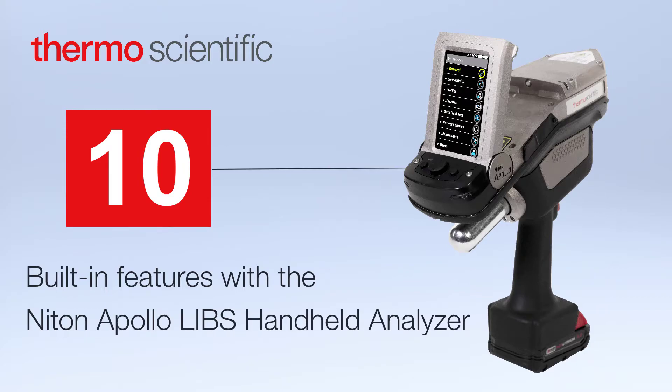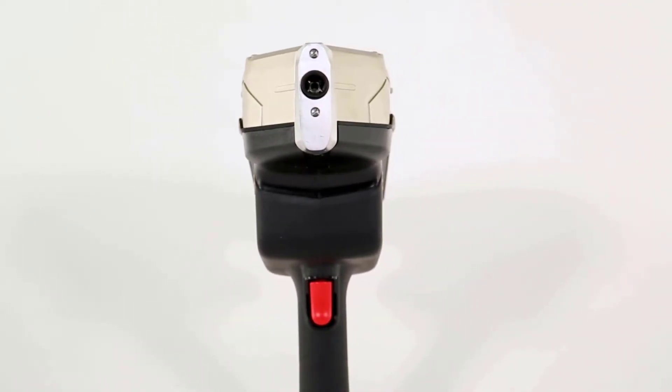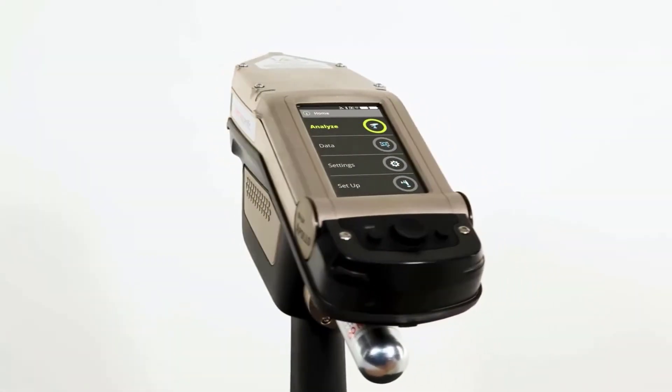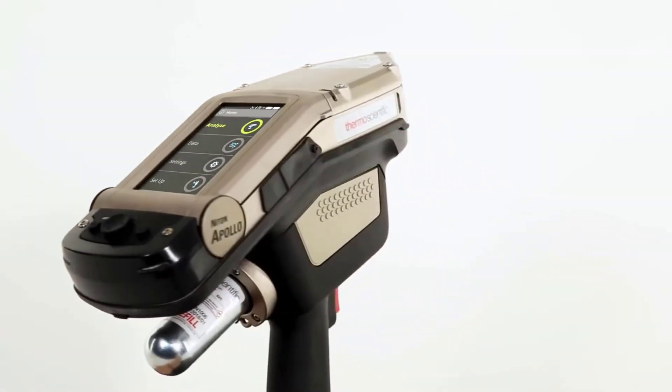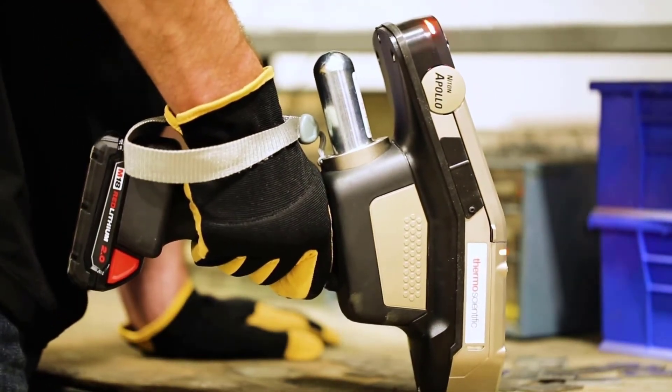The Niton Apollo Handheld LIBS Analyzer makes carbon detection easily accessible in any industry. With 10 key features, the Niton Apollo is an indispensable tool for material verification and quality control.